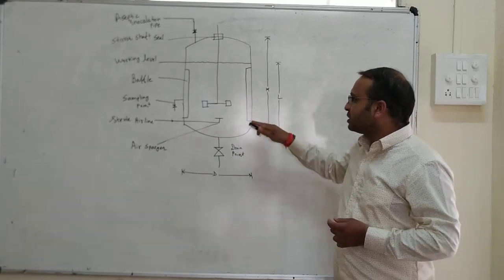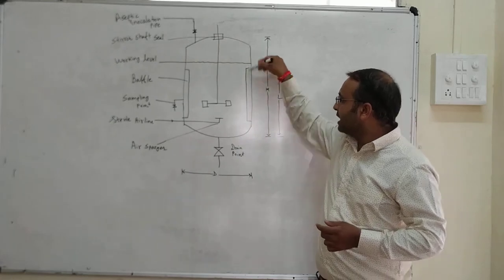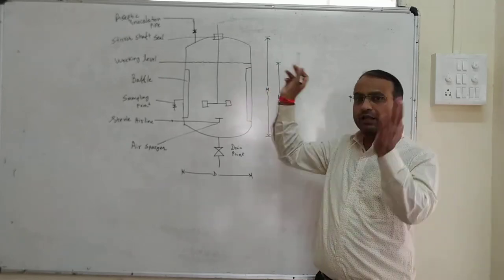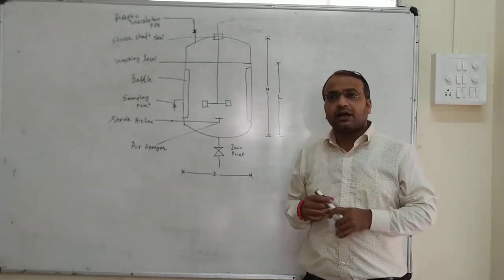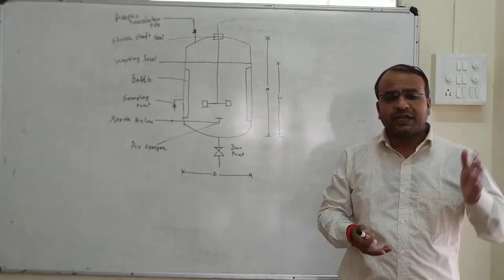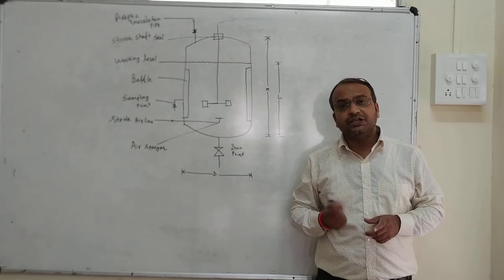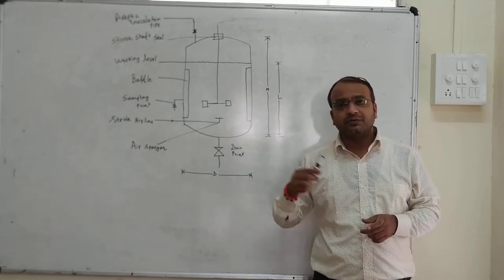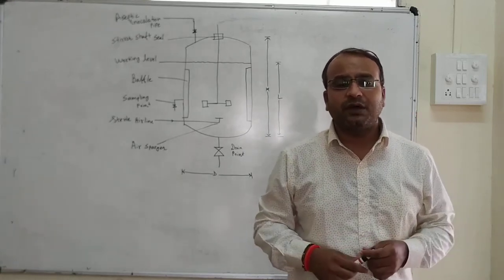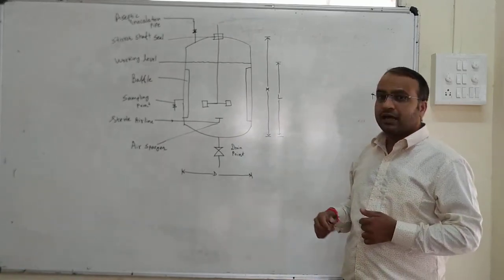Talking about the specifications of this bioreactor, here you can see the design. Here the H indicates the total height of this reactor. This is basically a circular vessel. I think you might have seen this kind of bioreactor at our lab. We have a smaller scale 3-liter fermenter, which is an automated fermenter. In addition, recently we have installed 5 reactors of capacity 10 liters each, and very soon we will be having a 100-liter reactor.